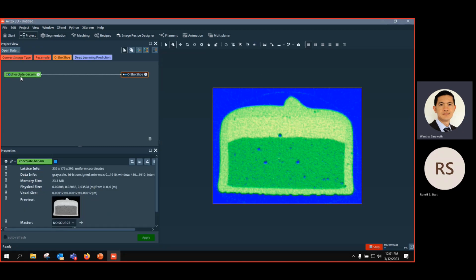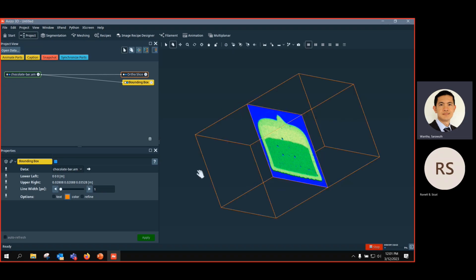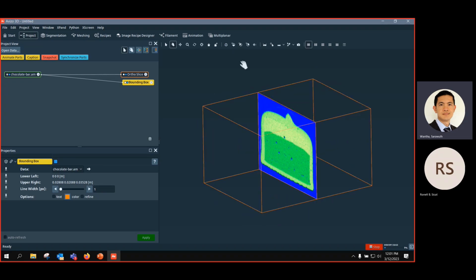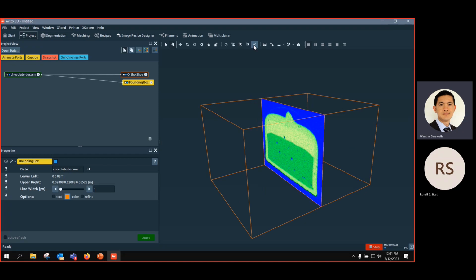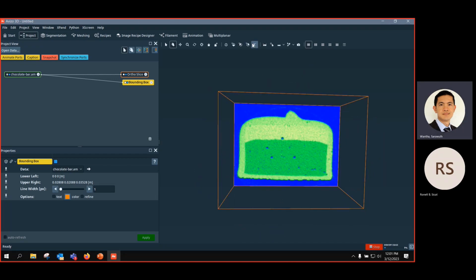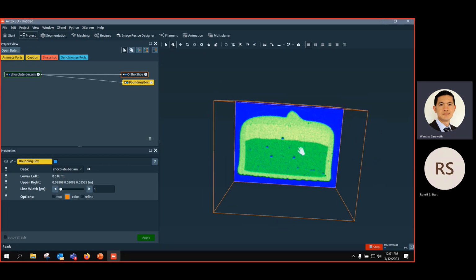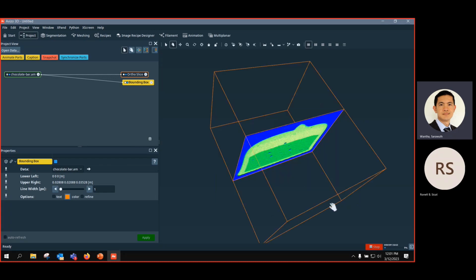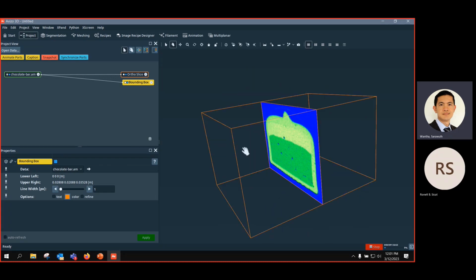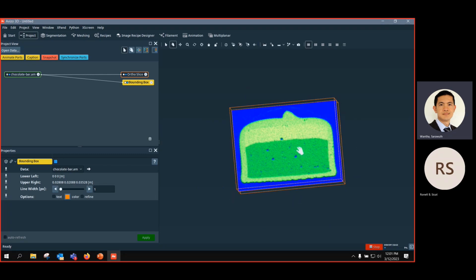If you look at this orthographic view and perspective view in 2D, it's not much different. But if I add a bounding box quickly to show you here, I can see that when I turn a bit, I start to see the bounding box in orthographic view or perspective view. Sorry, by default we have perspective view. For viewing, it's nice because you can see the dimension is different. The back is smaller than the front, but actually in the orthographic view, it should all overlap on each other like this.